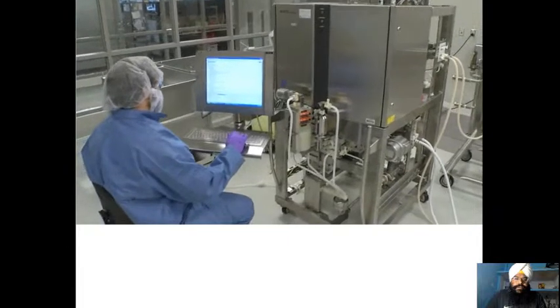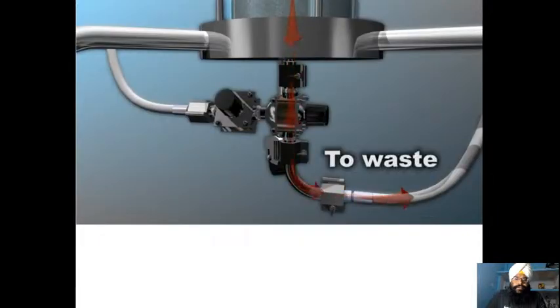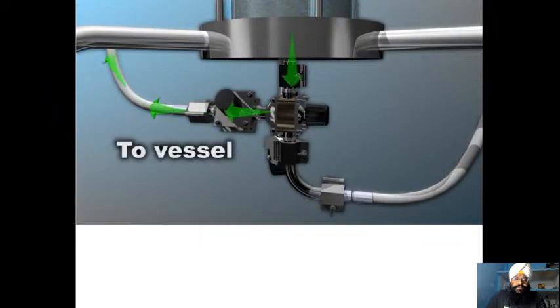The ultraviolet UV sensor monitors the concentration of protein in the product by observing the optical density of the passing solution. This sensor works hand in hand with the valves on the exit of the column. Through the controller program, we can set a protein concentration threshold. When the optical density of the solution leaving the column is below the threshold, the valve directs the flow to waste. When the optical density of the solution leaving the column is at or above the threshold, this means that solution contains our purified product and the solution is directed to a collection vessel.